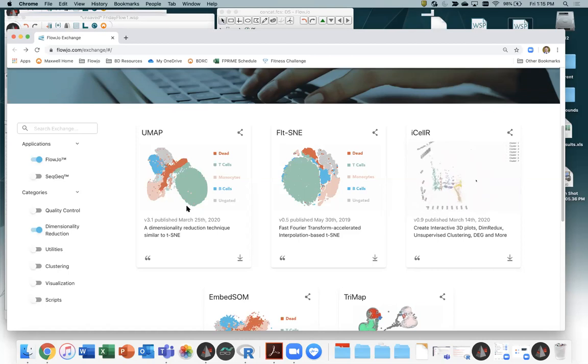So you would choose to use UMAP if you wanted to make sure your dimensionality reduced picture was emphasizing how similar or dissimilar clusters are. You would use t-SNE if you wanted to probably get the nicest looking picture, just to show how many populations are present. And then you might use other metrics to show how similar or different they were. And that might be fine.